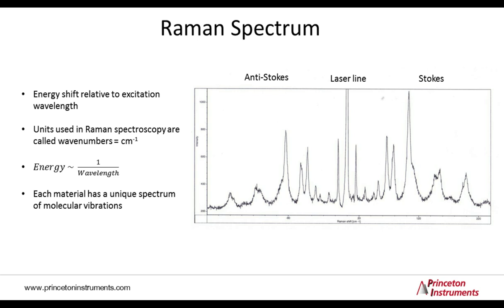As energy is picked up from or lost to vibration modes, Stokes and anti-Stokes lines are located symmetrically around the laser line. And as vibrations are typically excited by thermal processes, the intensity of the anti-Stokes lines in particular, that require vibrations to be present to be visible, will decrease with falling temperature.